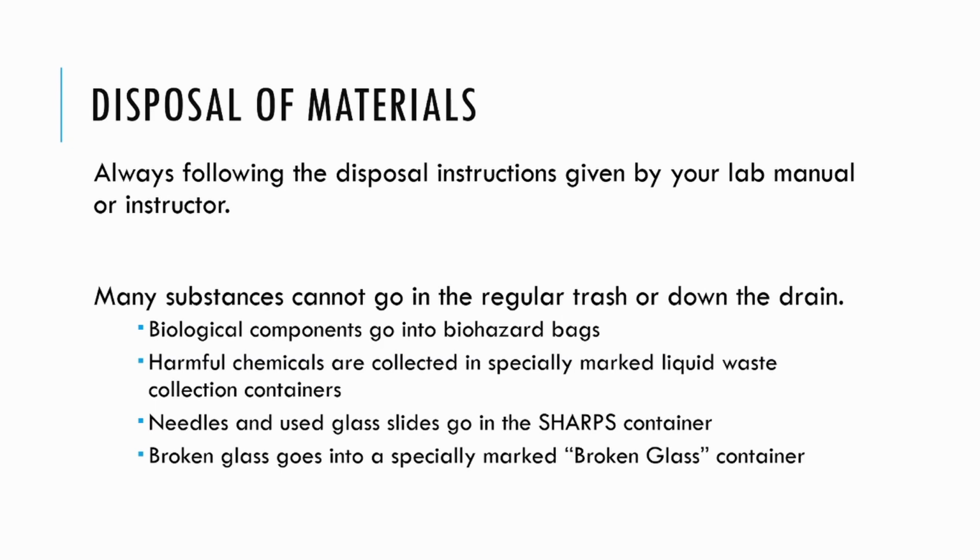If you're using needles or glass slides for a live or a wet mount, when you're done with those, they go into a sharps container. This is usually a red or sometimes white container that has a biohazard logo on it, and it is a special form of biohazard disposal for things that are sharp, as the name implies. It does not include broken glass though, so only needles and intact glass can go in the sharps container.